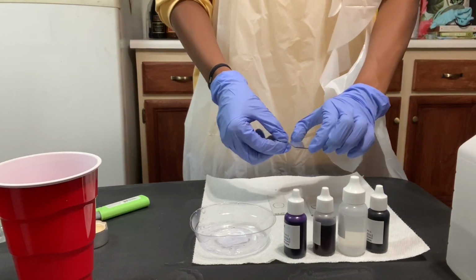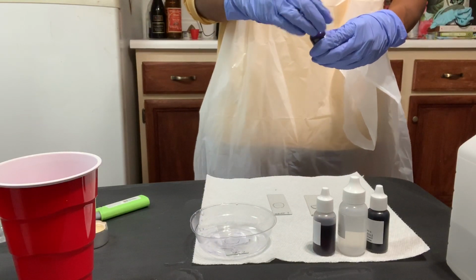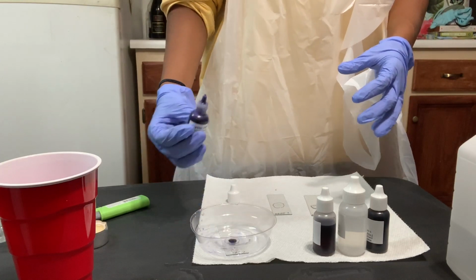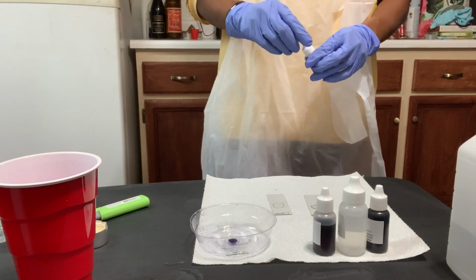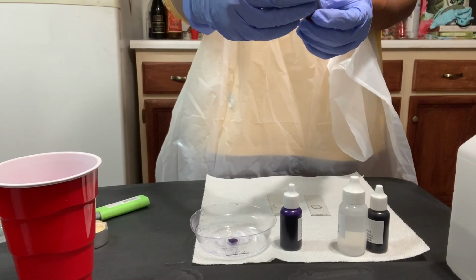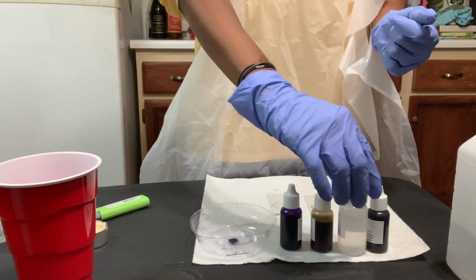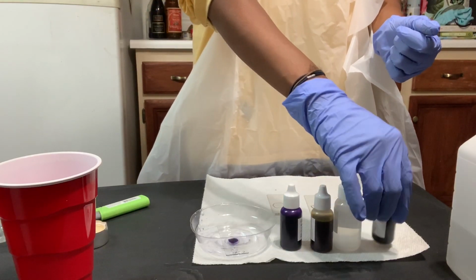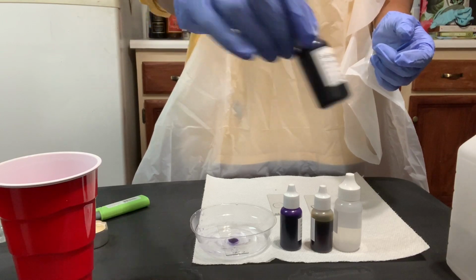So now I am going to place it in my staining tray, add 1 to 2 drops of crystal violet, and allow that to sit for 30 seconds. After that, I will rinse it until the water runs clear and add 2 to 3 drops of the gram iodine, gram stain number 2. Wait for another 60 seconds and rinse that. Then add my decolorizer, 2 to 3 drops. After 30 seconds, I will rinse that, and last I will add 2 to 3 drops of the safranin, and then rinse that.